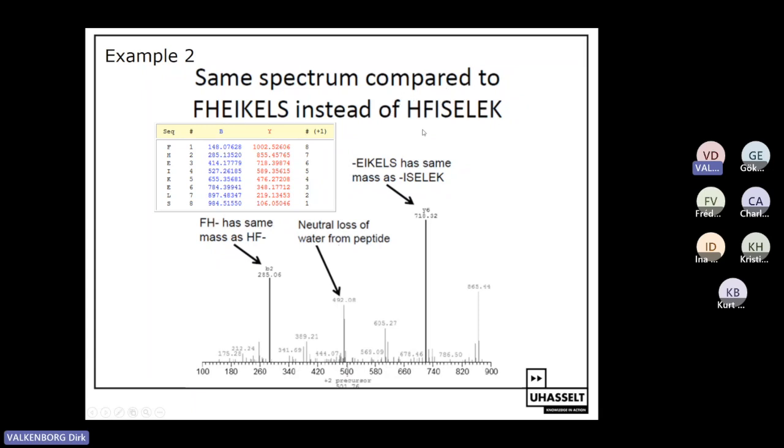So you see this mass matching when you want to do a peptide to spectrum match. It's a good idea, it's the best that we have, but there is some ambiguity present. And luckily today we have fragment peak intensities that come to help to reduce this ambiguity.